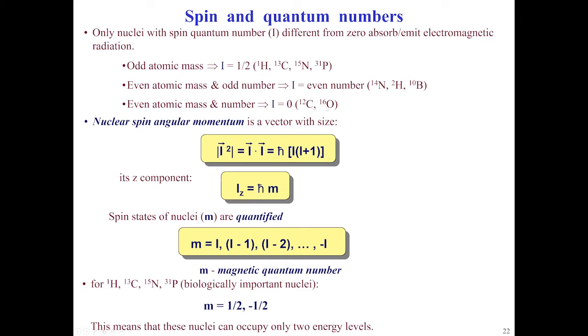So this was carbon 12, oxygen 16. So I would usually make a joke that the fathers of NMR were lucky because C12, which is really 99% populated, was not giving a signal. But don't get confused. Every element in the periodic table has at least one isotope that's NMR active. So whatever nuclei you want to study, there is a way to do it. Of course, with nuclei that have radioactive decay in a matter of milliseconds, that might be a bit challenging for many reasons.